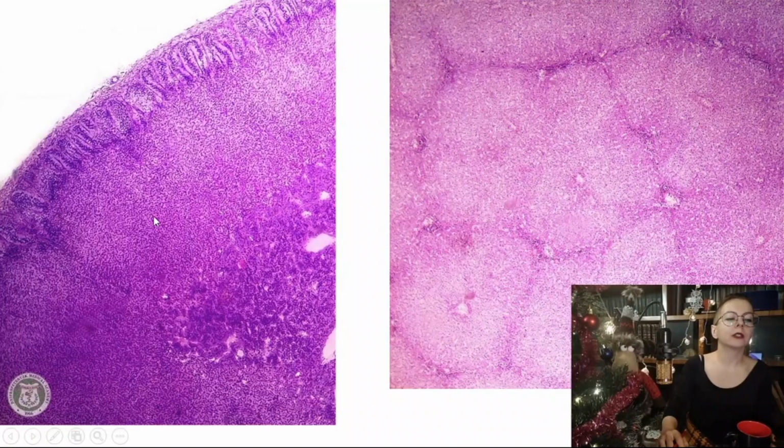After that, adrenal gland and the liver. If you look at the zona fasciculata, it might be confused with the liver, but that's why you have to analyze the whole specimen, do not look only in the center. In the adrenal gland at the periphery, you can see zona glomerulosa, and it helps you to distinguish it from the liver. Okay, and also in the center, medulla is darkly stained.